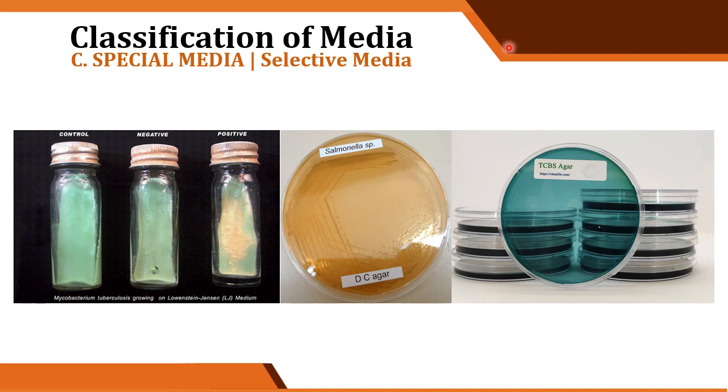Next is TCBS. This contains bile salts. Bile salt is a selective agent. It ensures the growth of only Vibrio cholerae and inhibits the growth of other intestinal organisms.